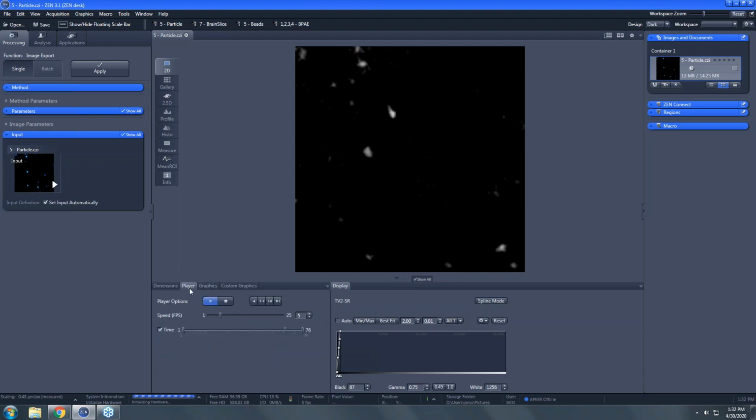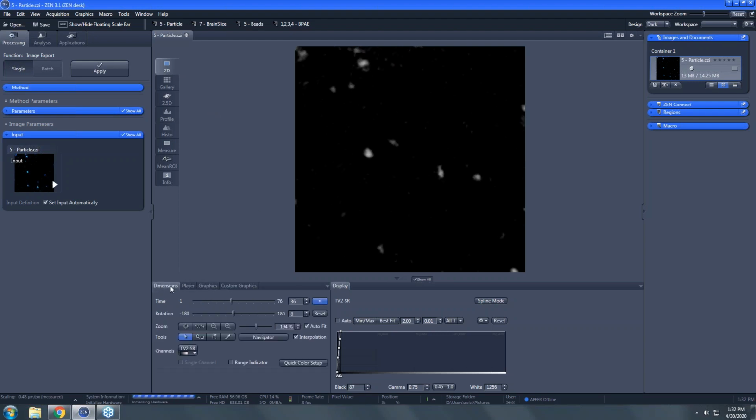We want to start by selecting the, oh, you're going to reduce the frame rate a little bit? Just a bit. I want to give Nicole some buffer room on her performance here by reminding everybody that she's doing this on a moving particle of nanometer size with a lag on the webinar. So it can be challenging.